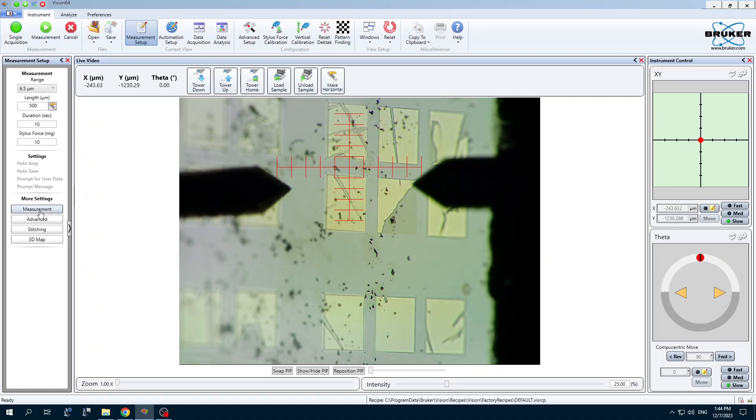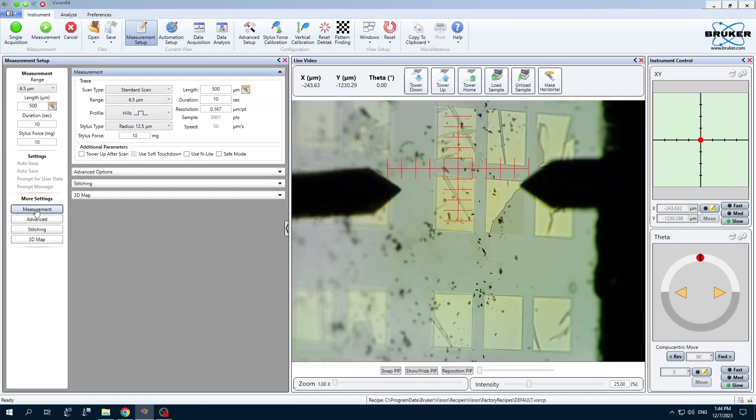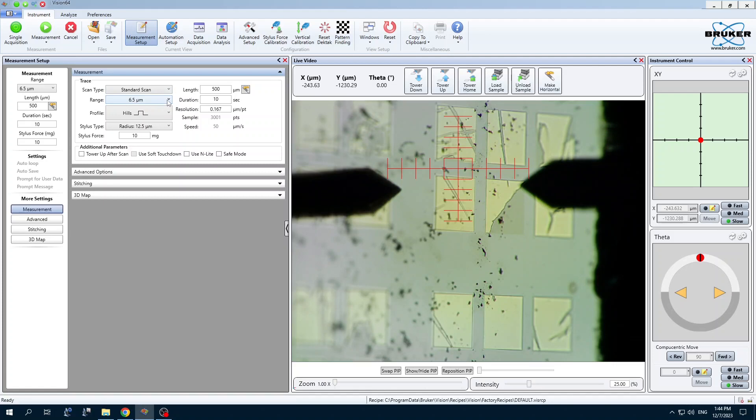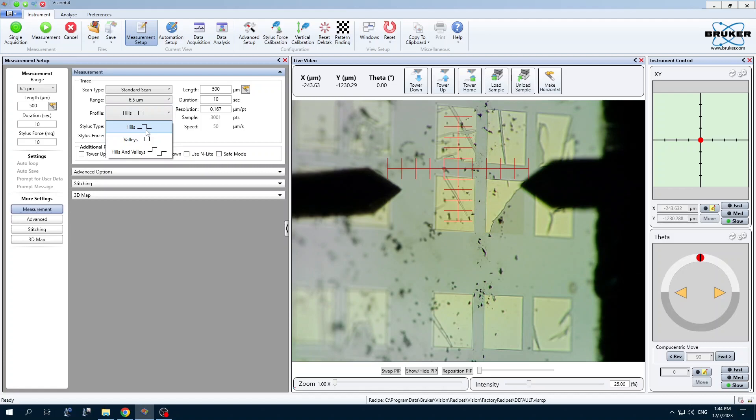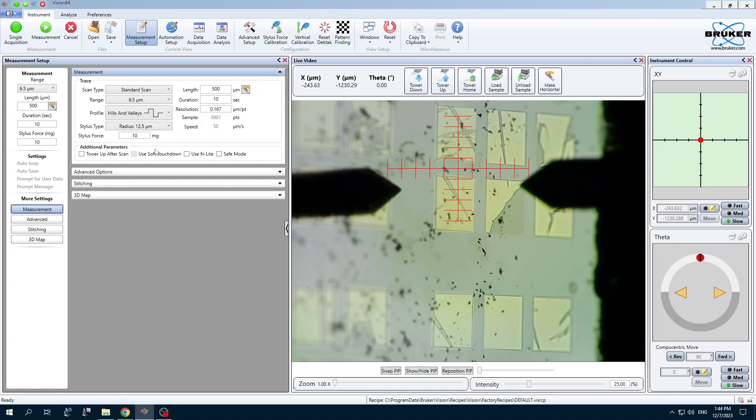It's important to check the details of the measurement setup. We're going to show you a standard scan today for the range. Choose an appropriate range for the features in your sample. Hills and valleys can be tricky because you only have 100 nanometer floor here and a 100 nanometer roof here. Just in case your sample is a bit tilted, more than 100 nanometers, you might want to choose hills and valleys. That'll reduce your range to 50% of this range here.